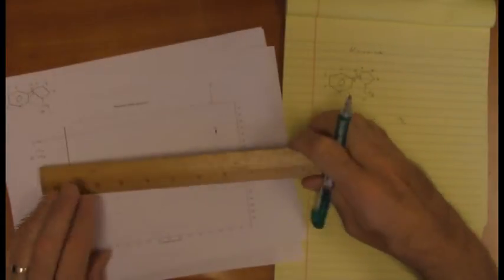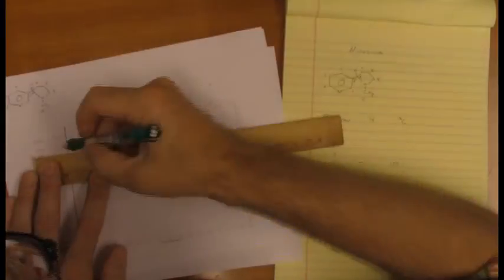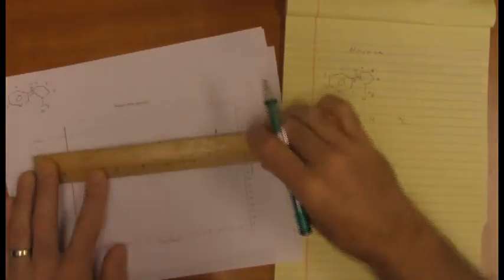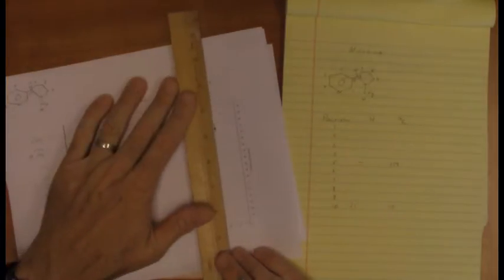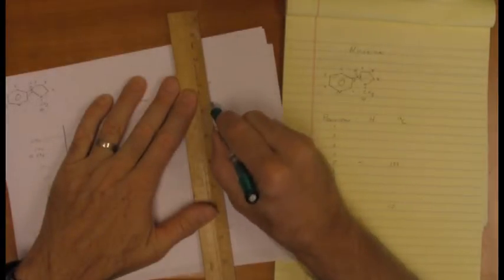And I want to point out the HSQC, sure enough, shows, if we draw the straight line out from position 10 to hit its cross peak, we have to make sure it's nice and straight, and then turn and go to the other axis and draw its straight line.